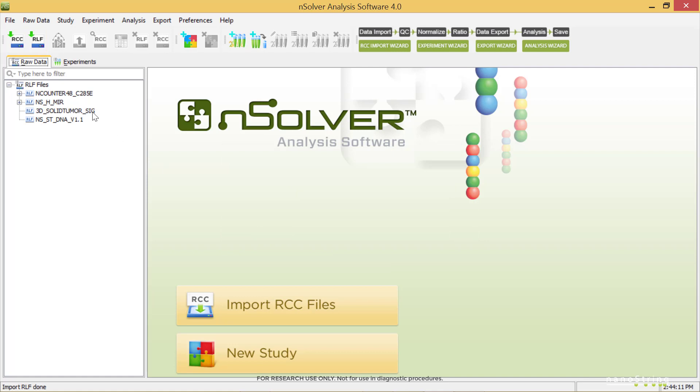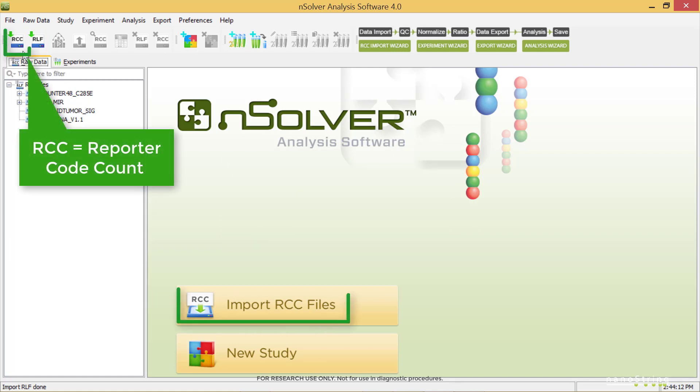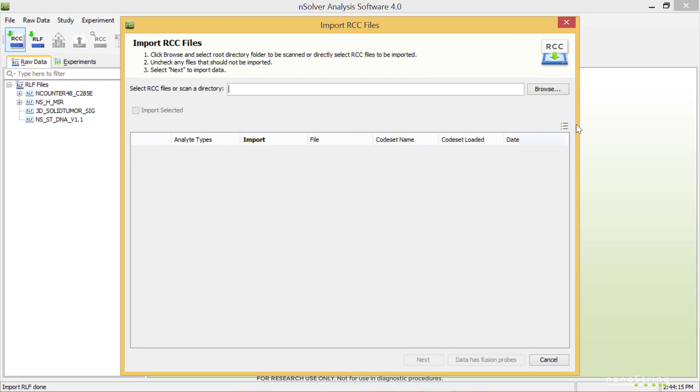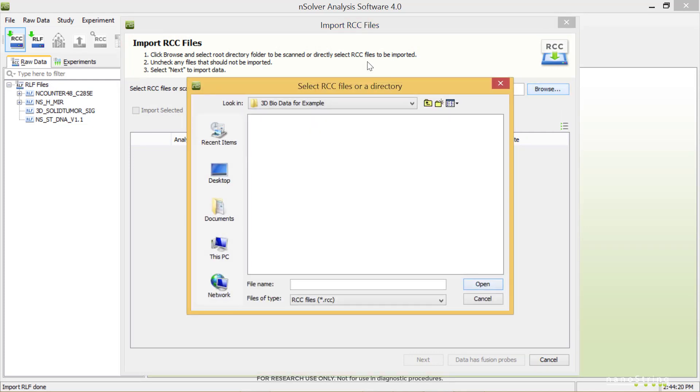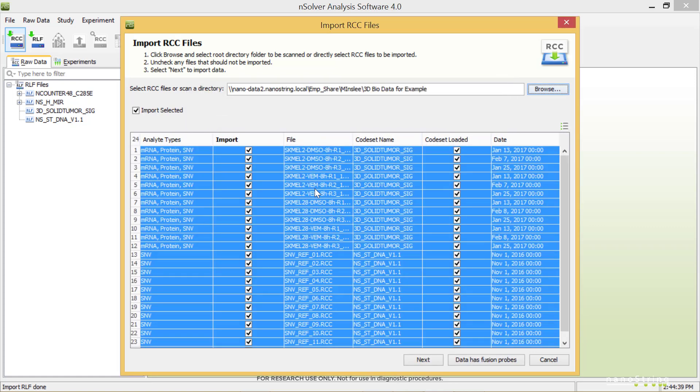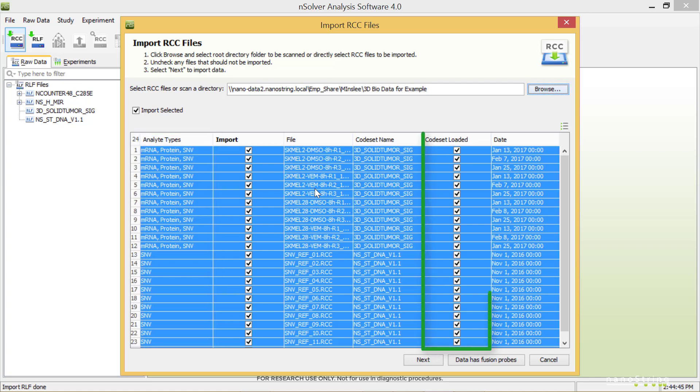Next, we'll import the RCC files. Select one of the Import RCC Files buttons. Browse to navigate to the folder with the unzipped data. Highlight all RCC samples and select Open. Note that the Analyte Types column lists the analyte types detected in your data, and the boxes in the Code Set Loaded column are checked, indicating that we've already imported that RLF file.